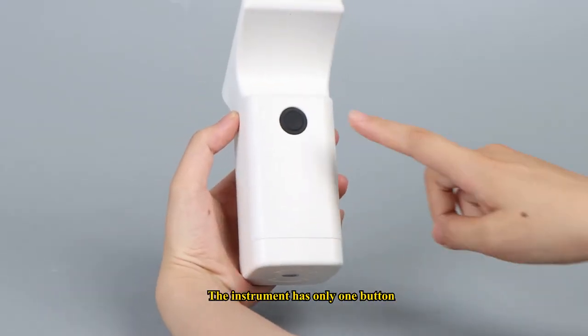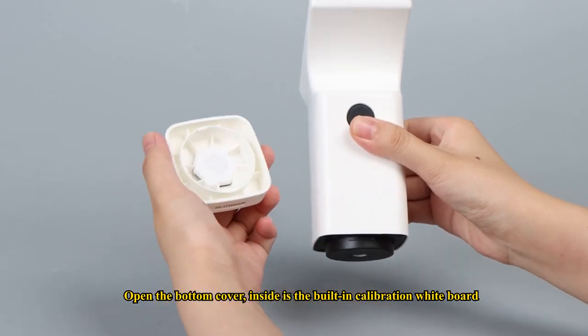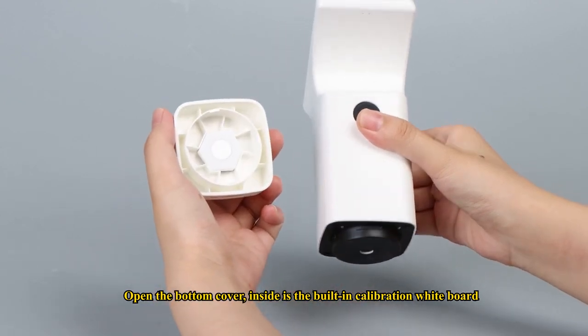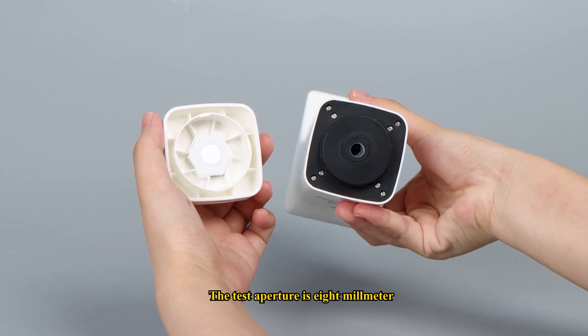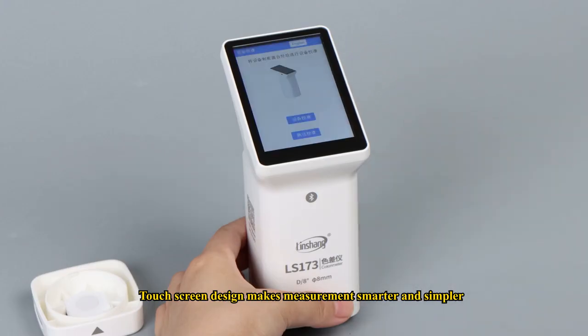The instrument has only one button. Open the bottom cover — inside is the built-in calibration whiteboard. The test aperture is 8mm. Touchscreen design makes measurement smarter and simpler.